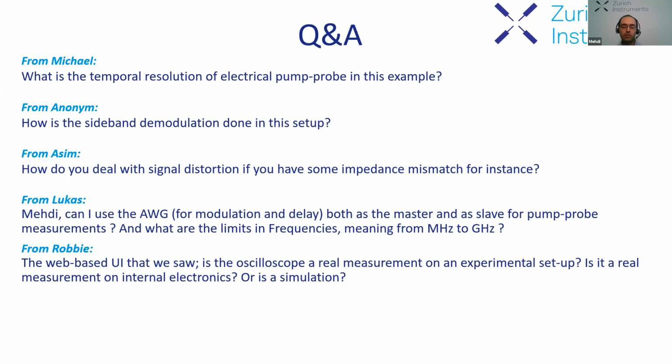It's a real measurement. It's a real-time measurement. I'm generating a signal with the device, and I'm measuring the signal with the device. There is an oscilloscope module on the software, partly on the device, which acquires the signal fast with a sampling rate of 1.8 gigasamples per second. And then it is sent to the computer shot by shot to provide the signal visually for the user.